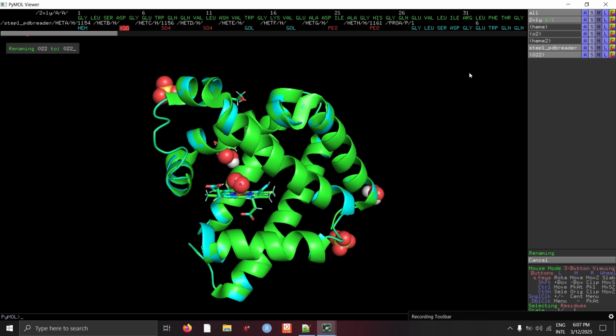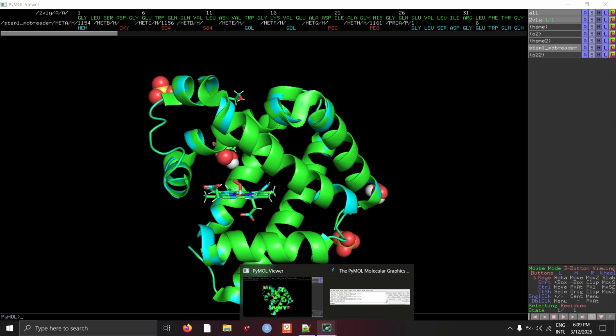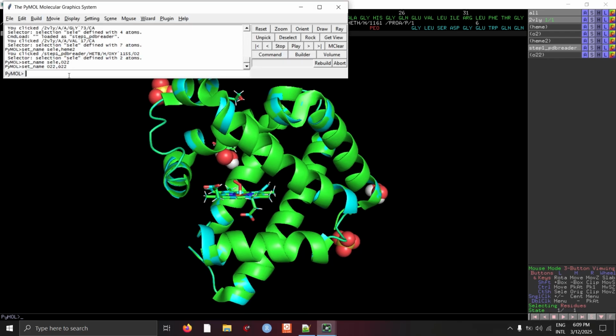Actually, I did that wrong. I did a 0, it's an O. O22, okay. And I'm gonna change that into sticks also. Show as sticks.